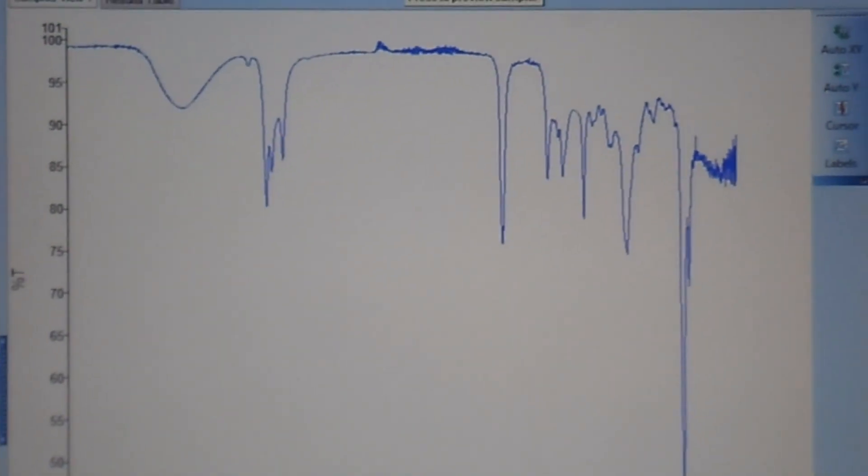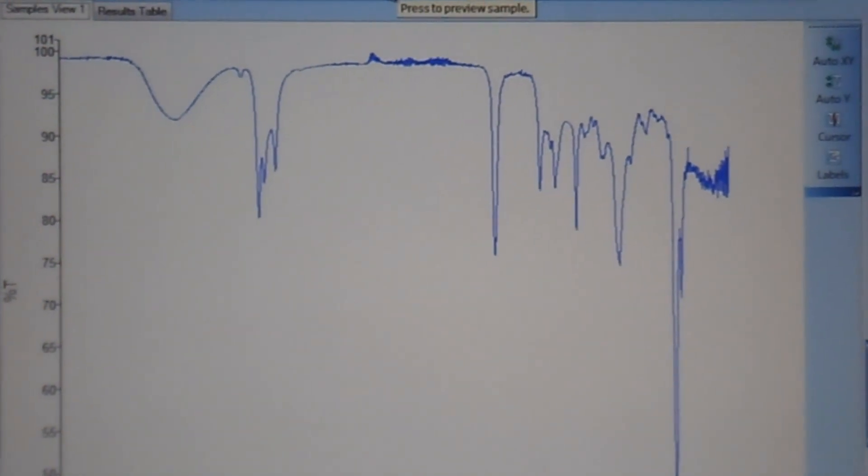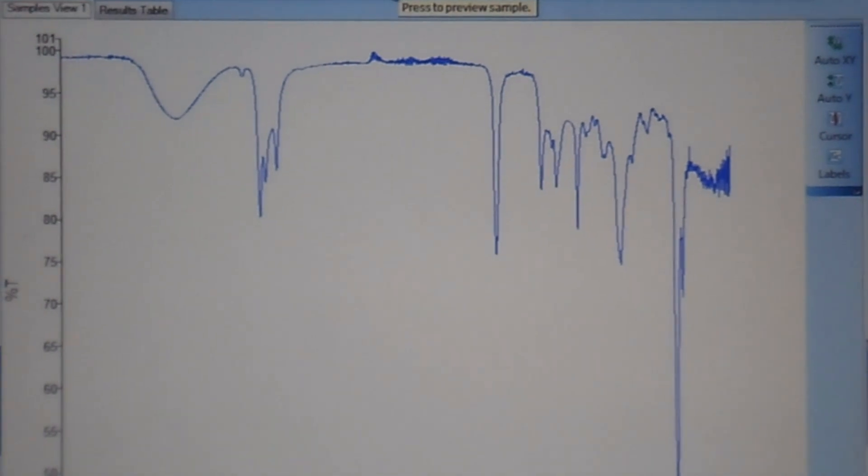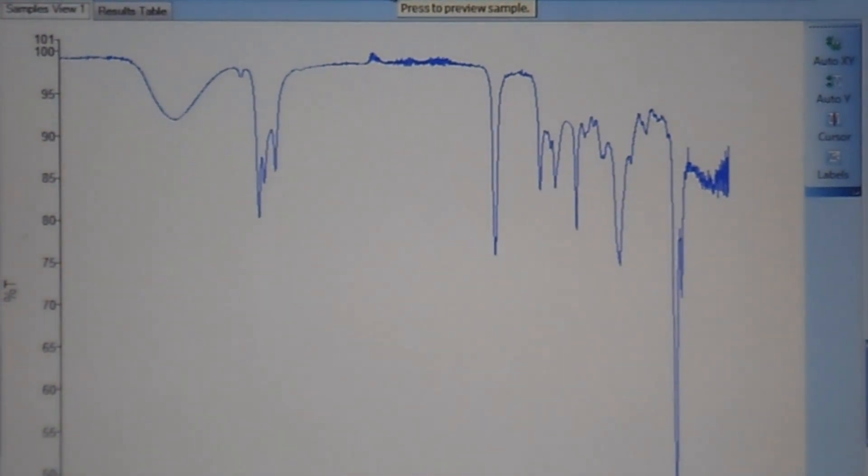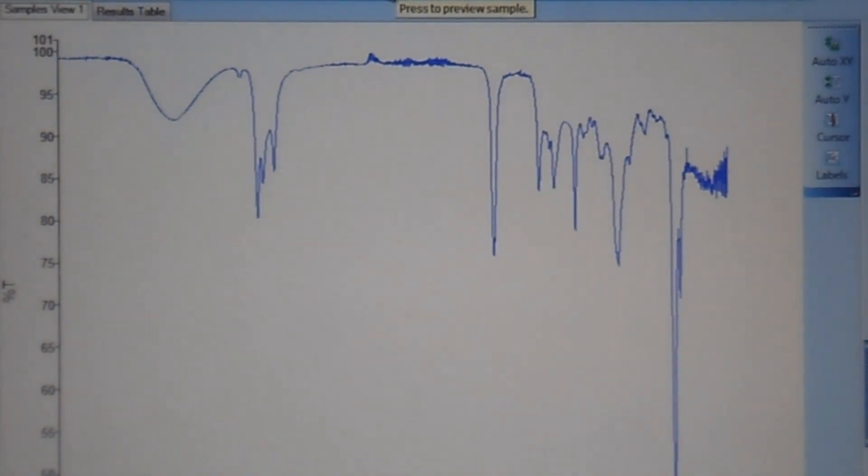And there is our IR spectrum for you guys. It'll be labeled and attached at the end of this video. Hopefully you enjoyed watching our lab for today. And I guess until next time, goodbye.